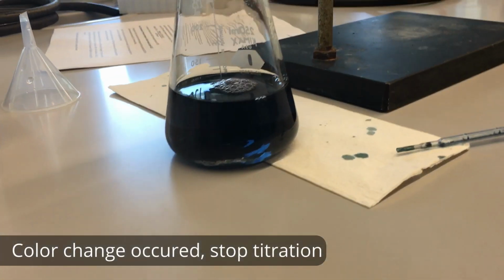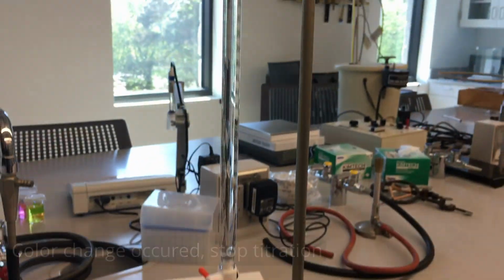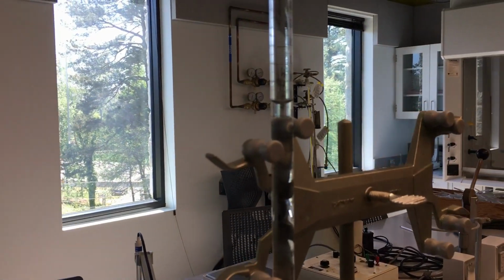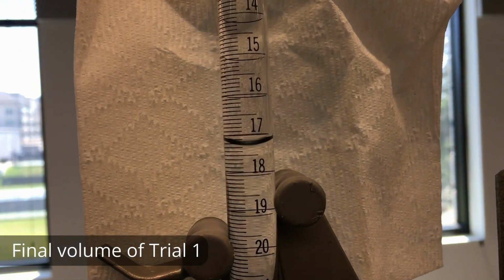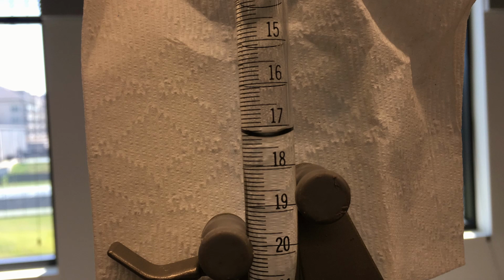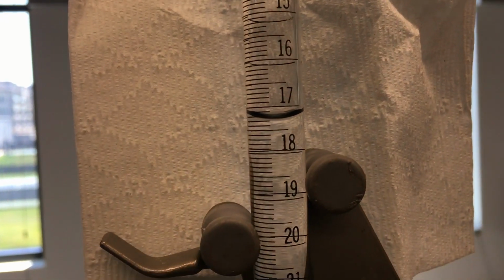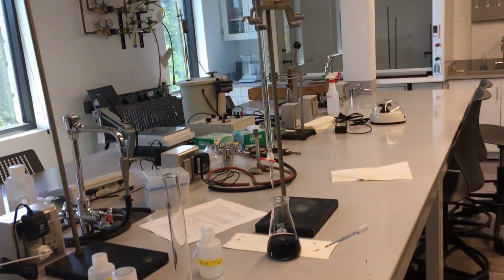All right, so you see there, we now have turned that purple solution into a bluer solution. It's a little bit more difficult to see, but the color change is definitely there. Now we can see our final volume here. So our volume delivered of EDTA is, of course, our initial minus our final volume, or the difference between the two. Now the data for the other trials will be given in the data sheet here.